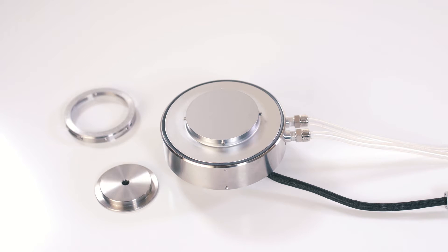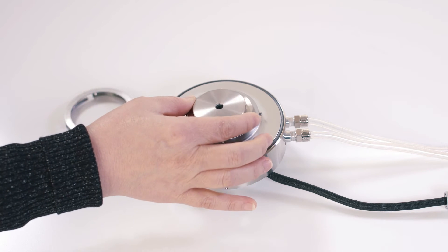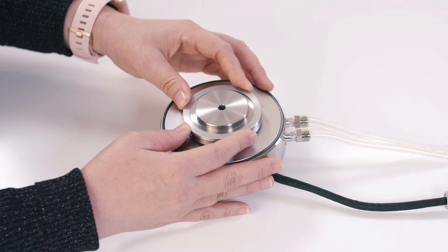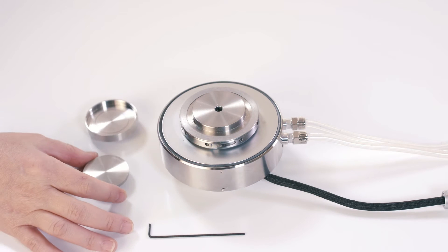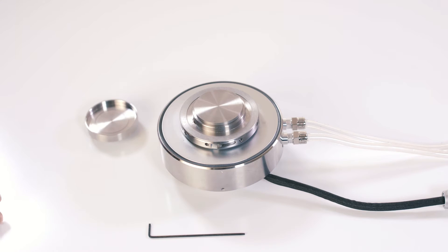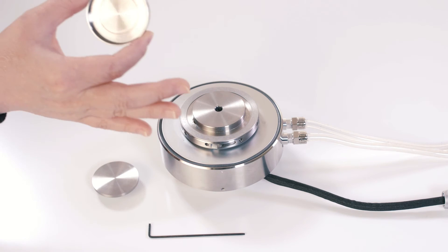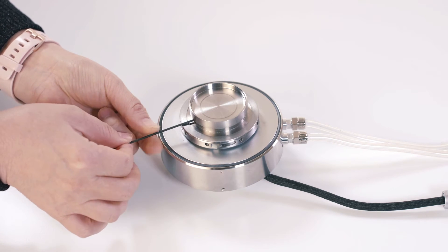If you are using the Peltier temperature control system for the advanced Peltier plate, you will need to attach this triboreometry holder to the top of the Peltier plate first. Then insert this 40 mm disposable plate or this 45 mm stainless steel cup to the holder, and tighten the screws on the side.